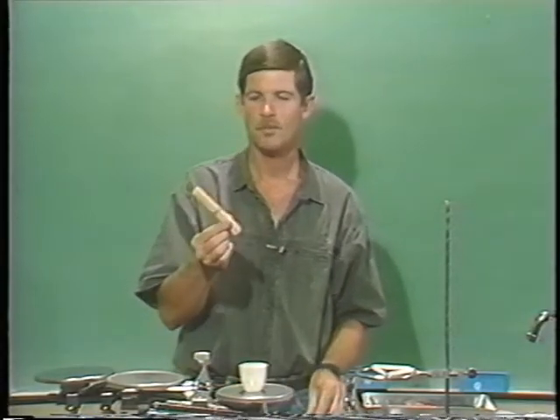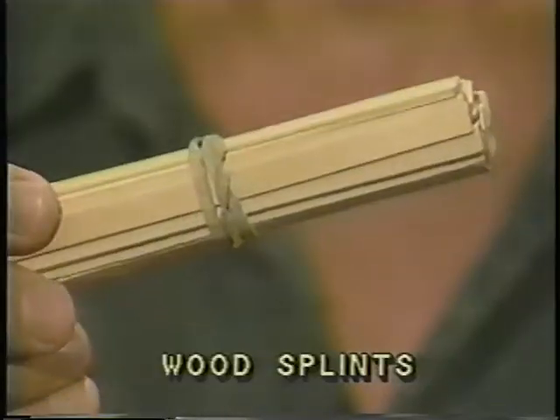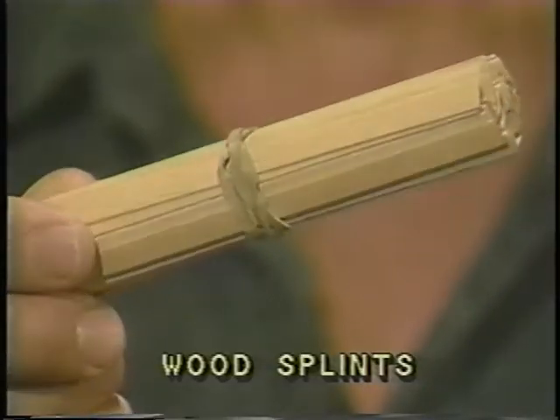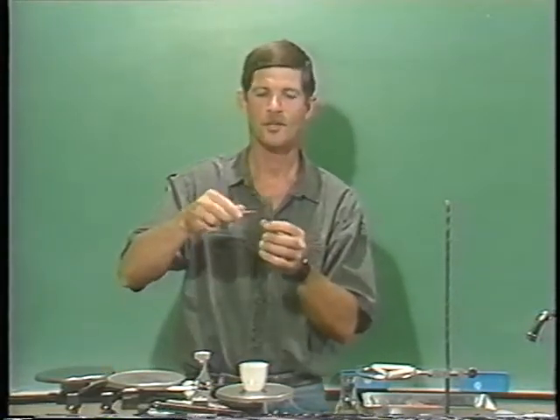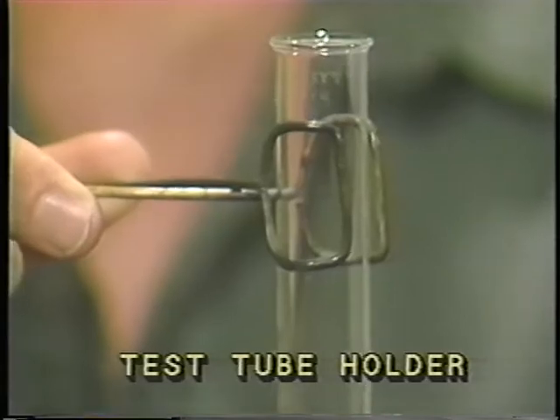Finally, we have a few odds and ends. These are called wood splints, and they allow you to light something up and not be as close as a match might get you. Then we have thermometers. Everybody knows what they are, and they come in a variety of shapes and sizes. And of course, if you have to pick up a test tube, you want to use a test tube holder. That's this little clamp device right here.